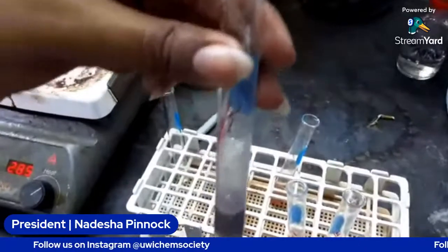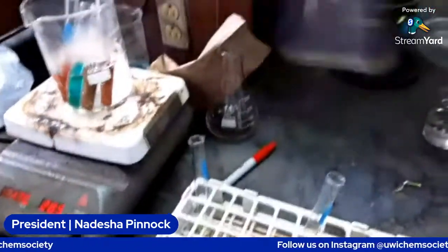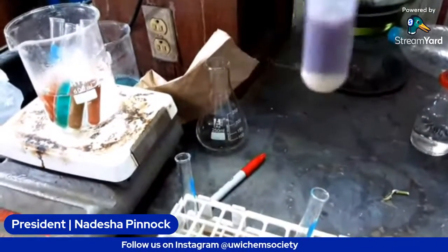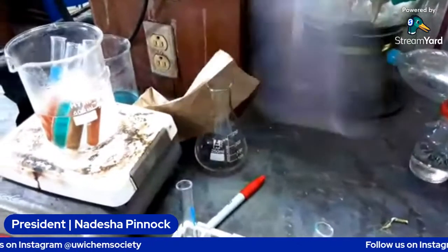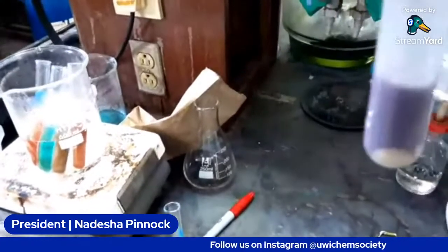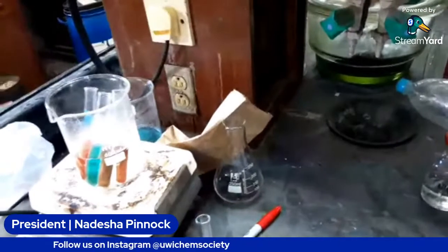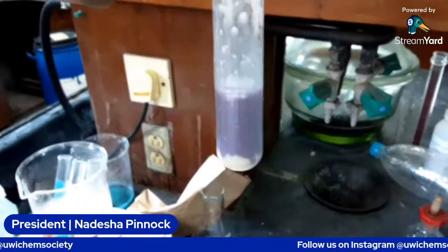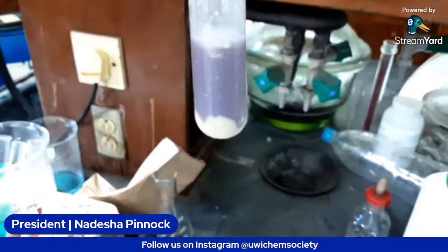So it's turning more and more of a purple color. Because the cheese is thick, we're just stirring to get everything in there. But similar to the milk, it's a mauve color because cheese is orange or light yellow before we added the water and everything. And then now we have a mauve color.